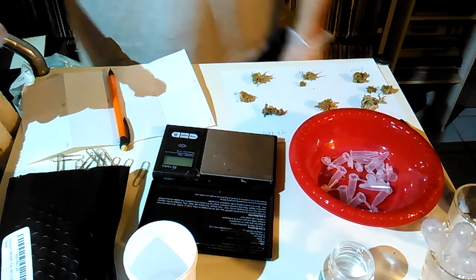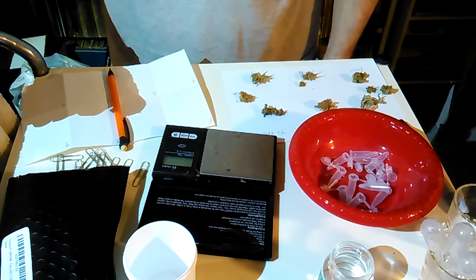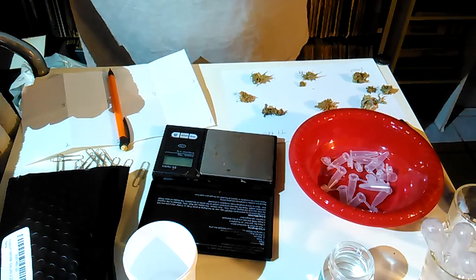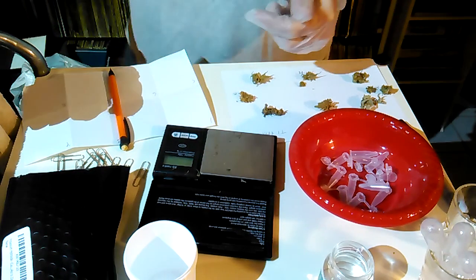So here are the actual instructions. It only takes 2 ingredients, which are pretty easy to get and cheap. It's rubbing alcohol, 91% or greater. I don't know if 70% works or not. I've heard that you want to use 90% or more.